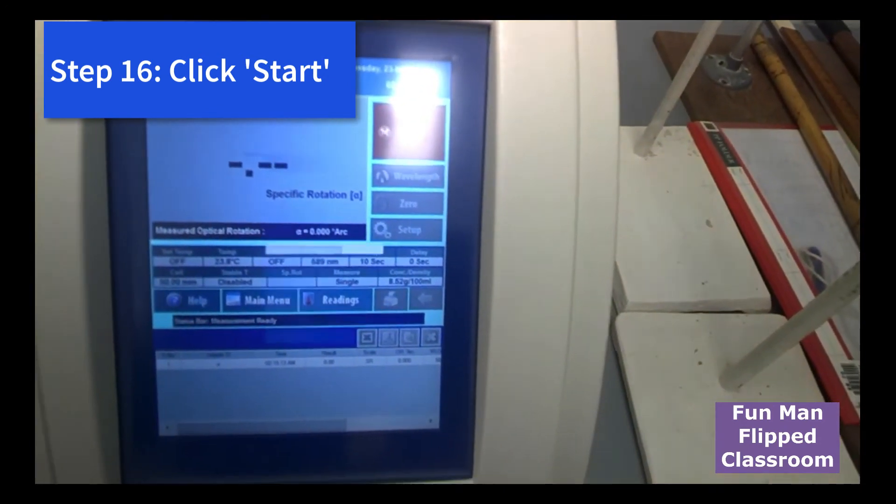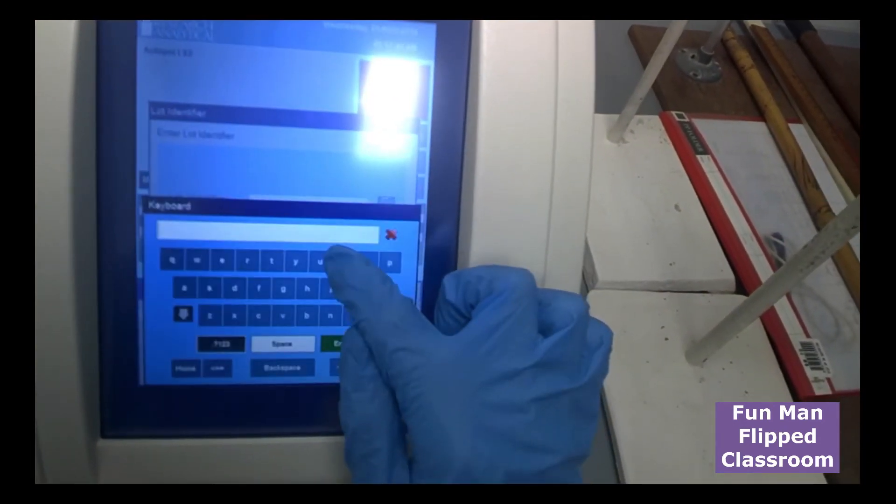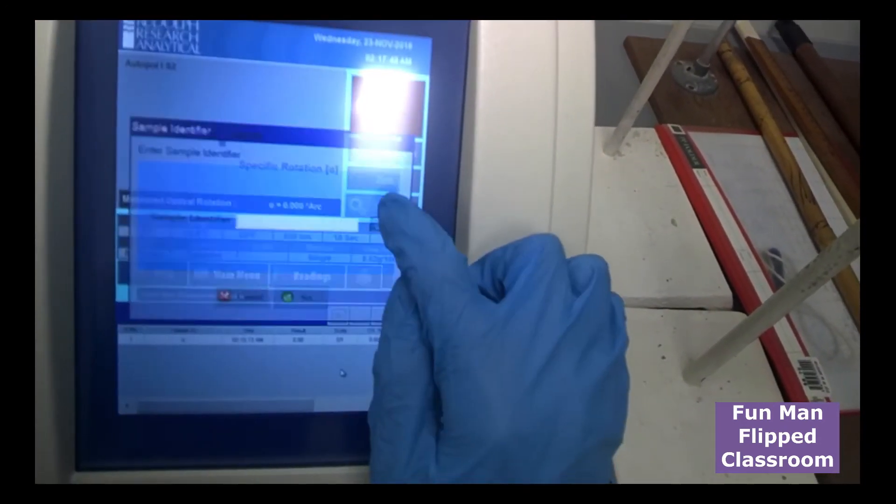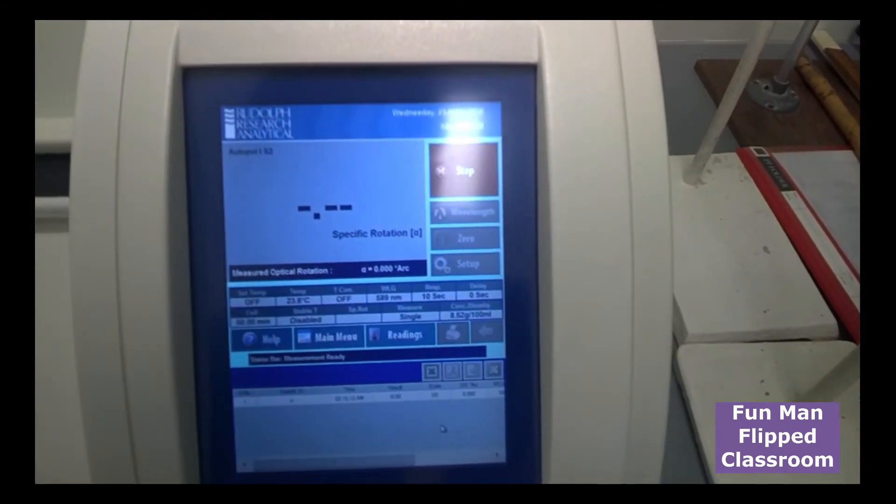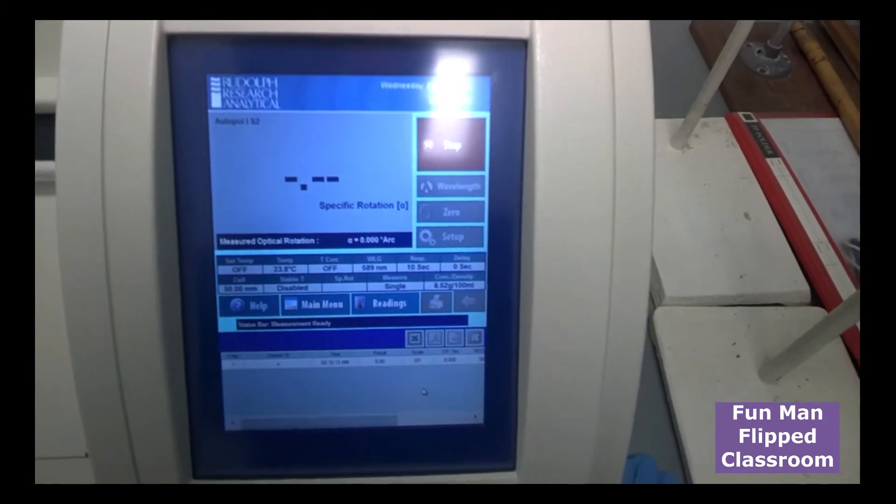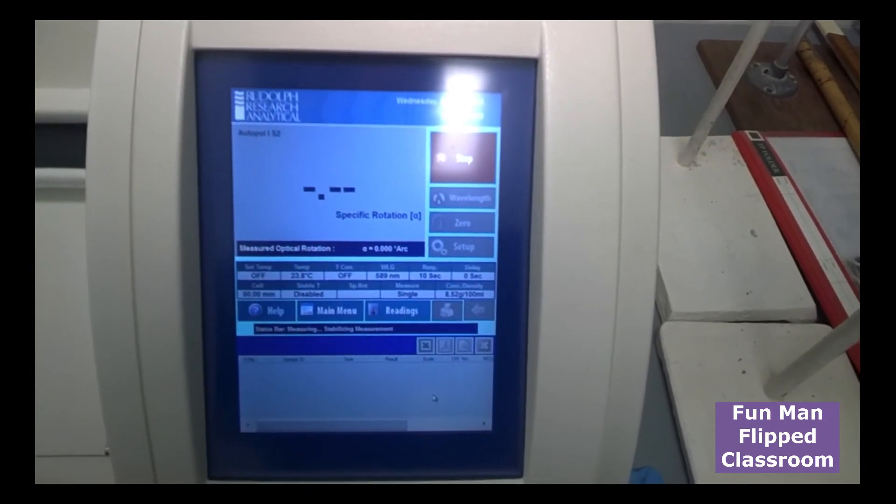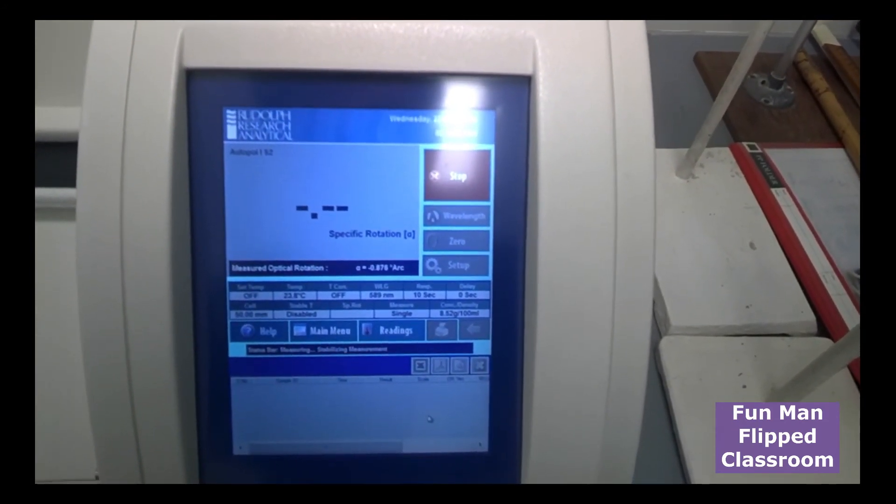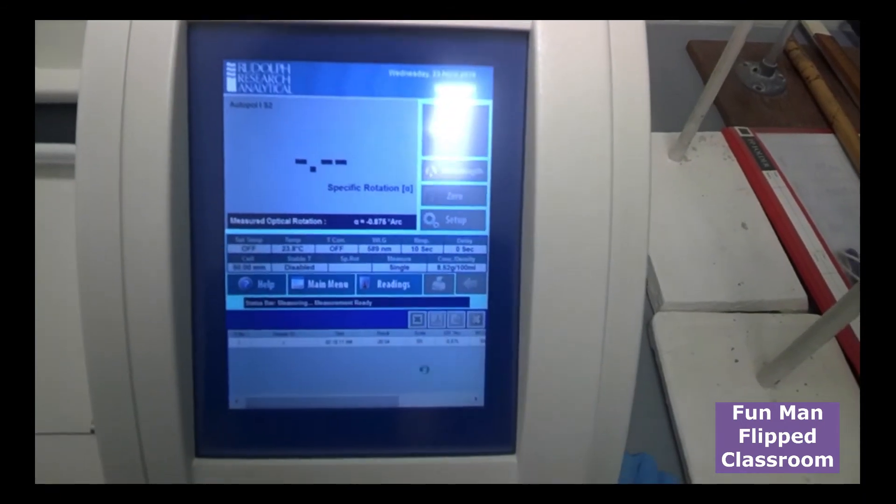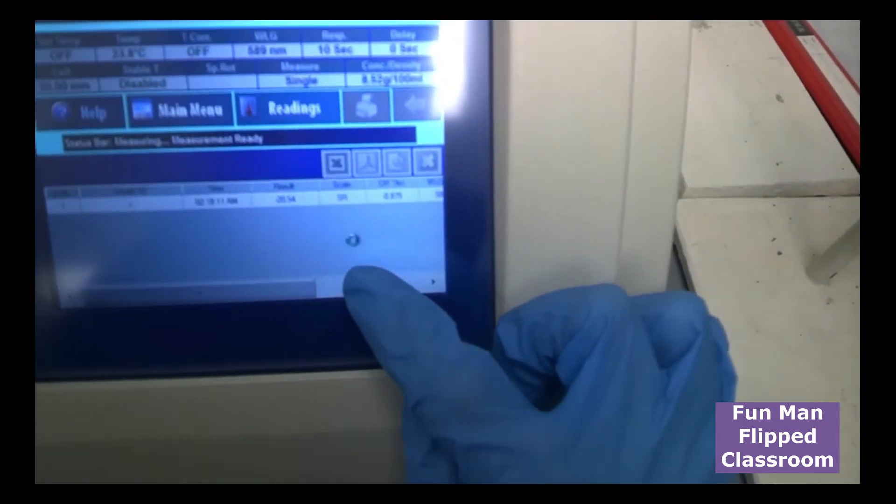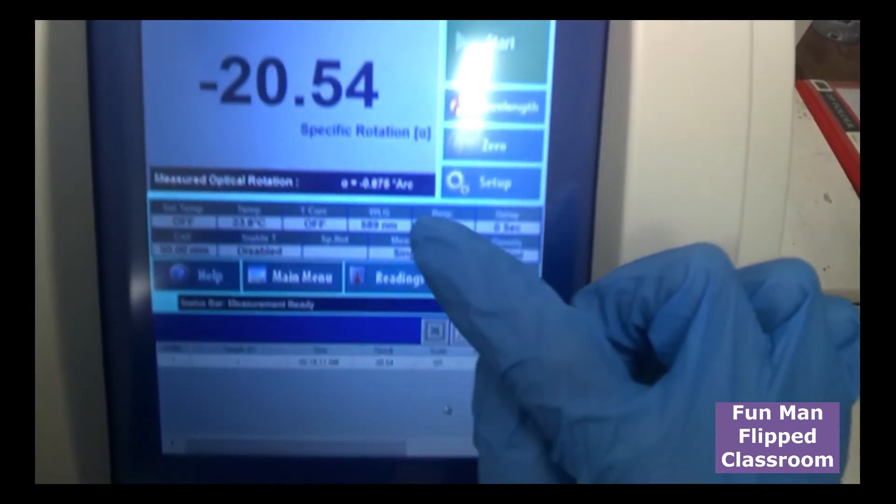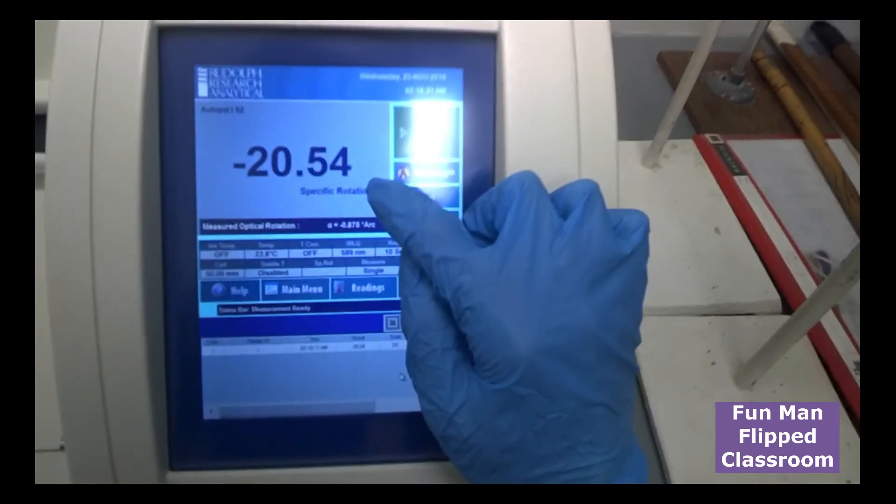Again, same thing. Identify it using a letter. The reading should come up soon. You see it's running there. Here you go. So that's the value you can take note.